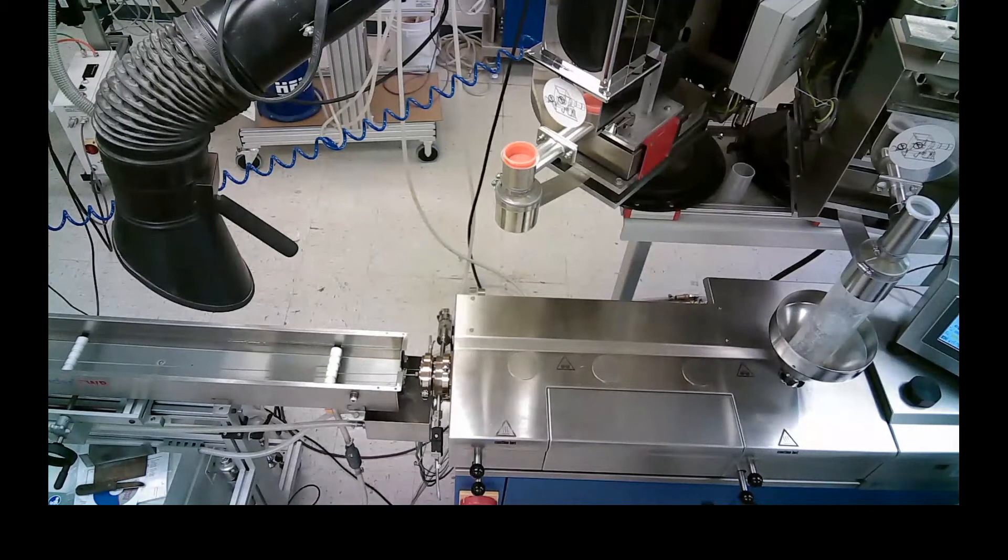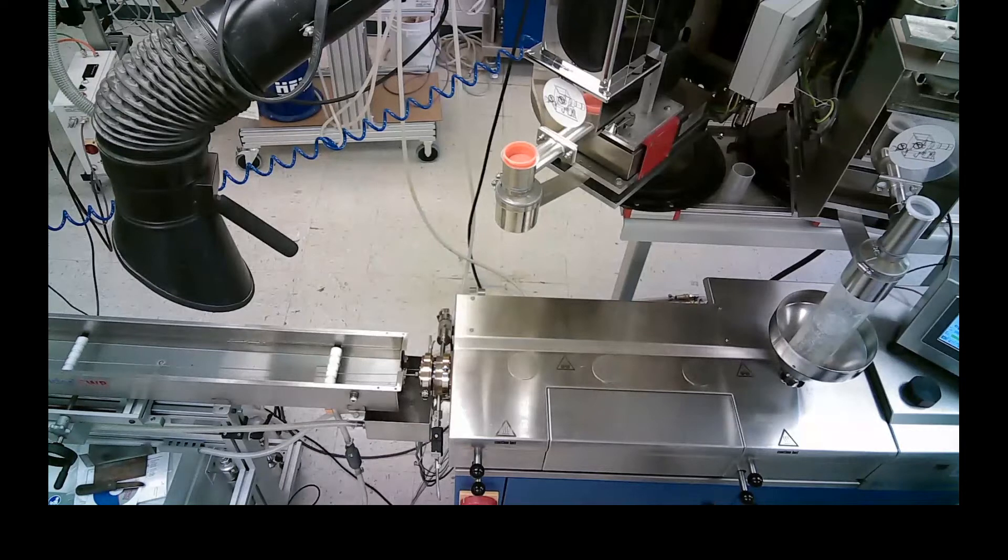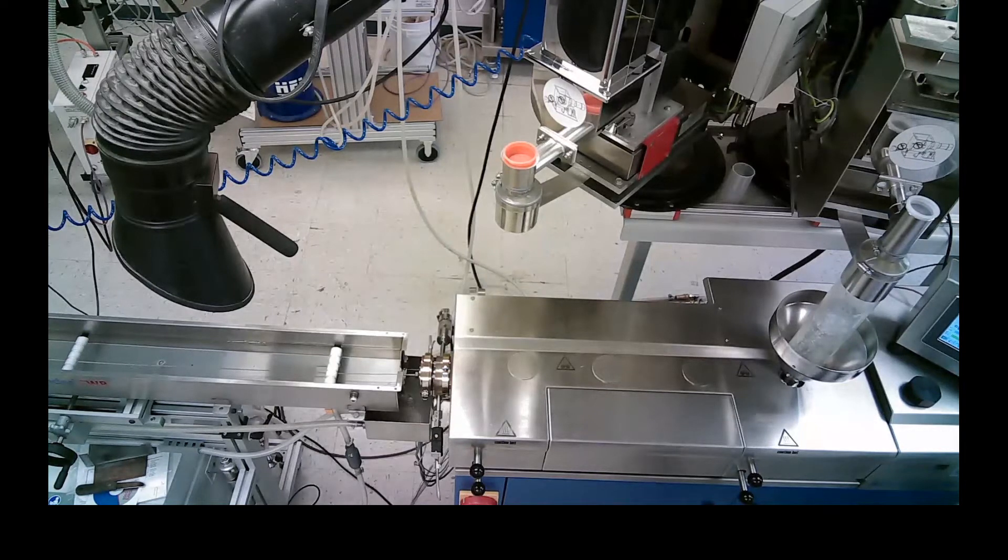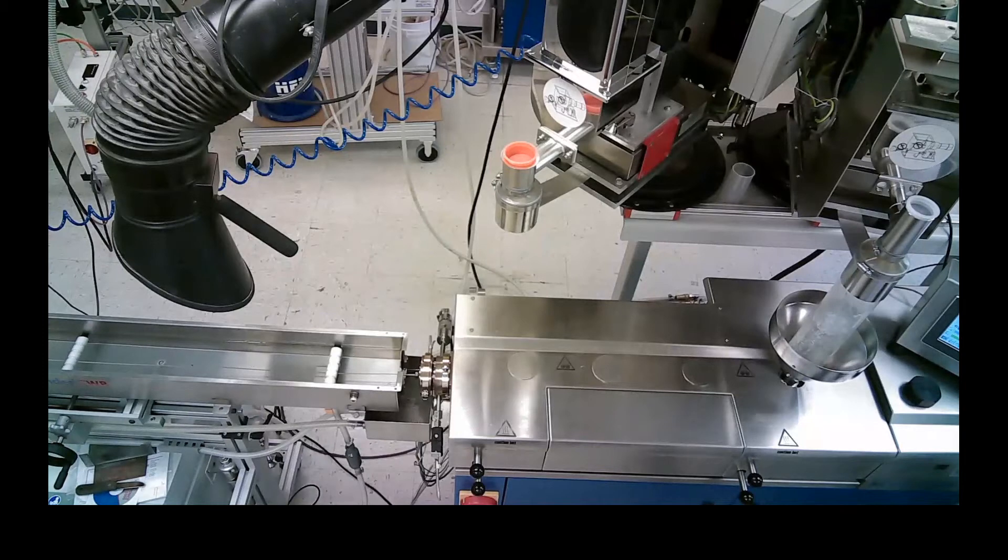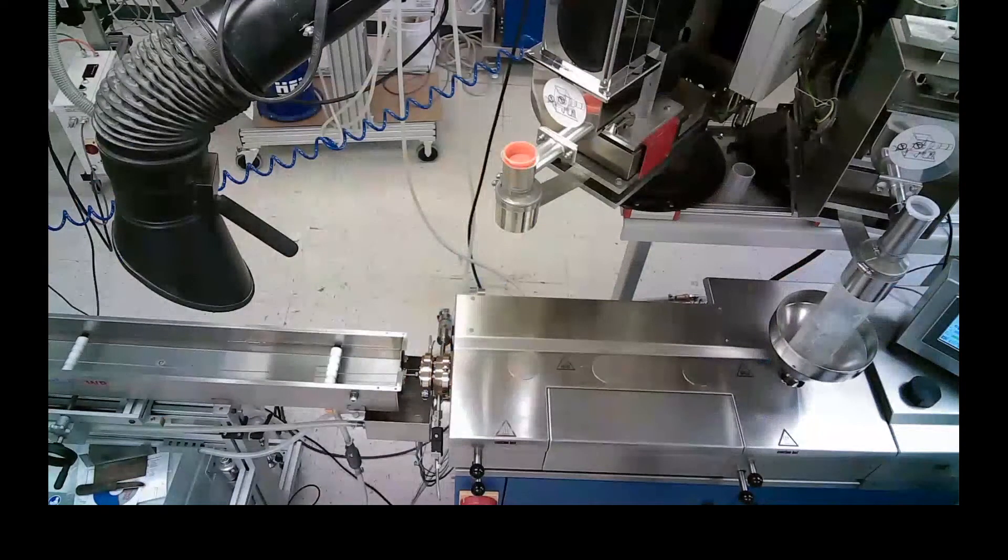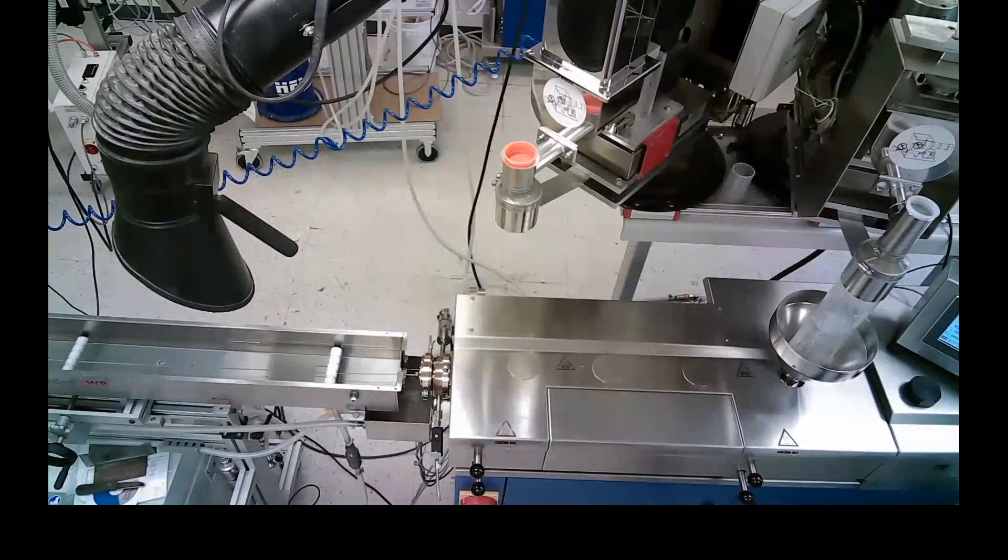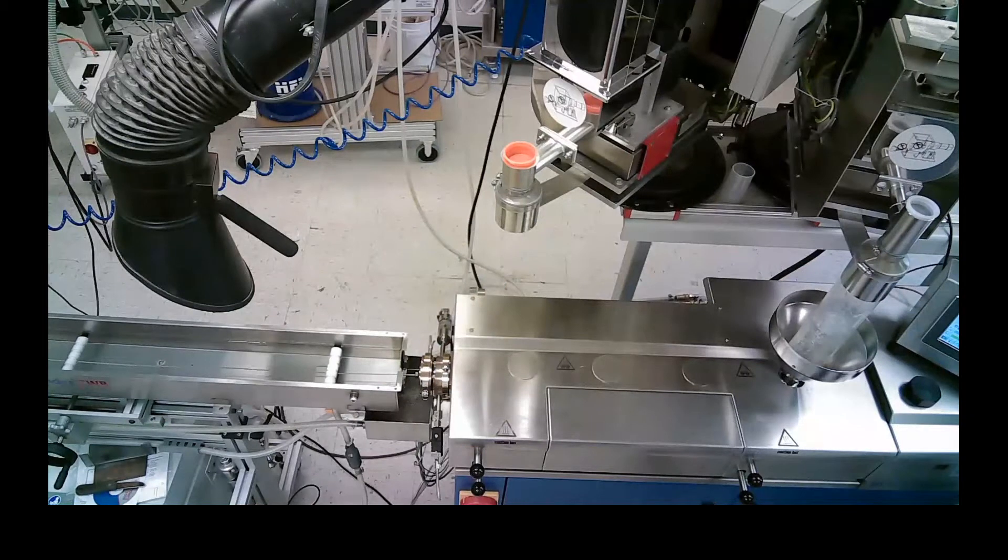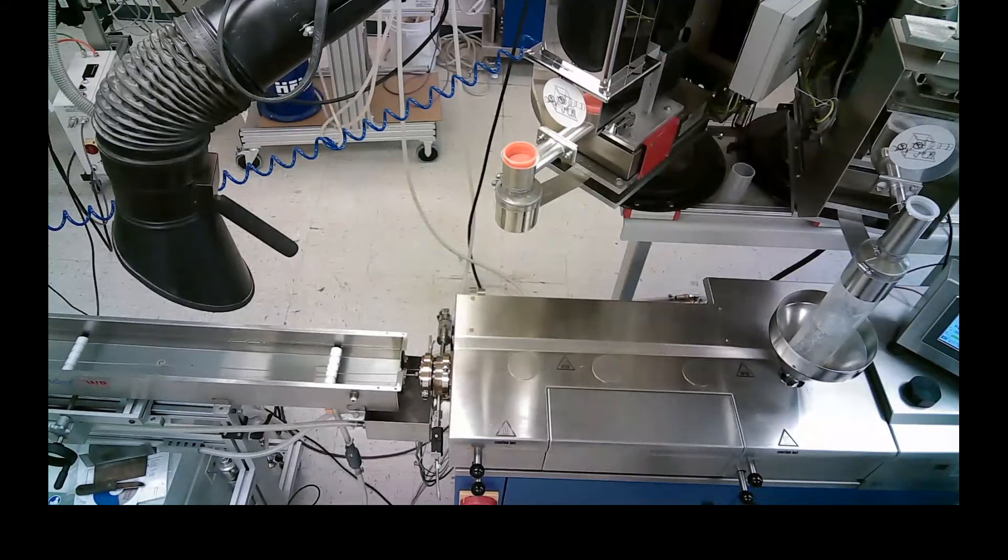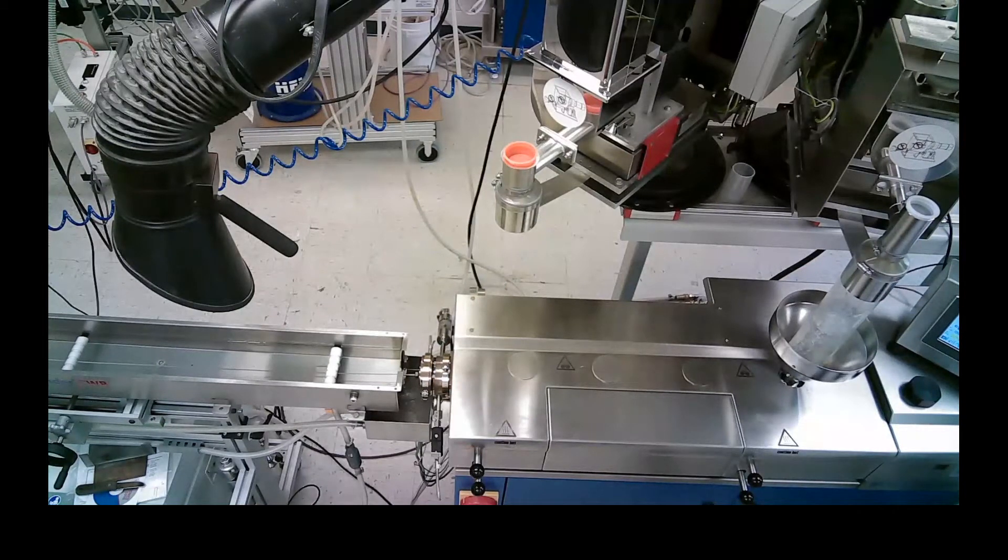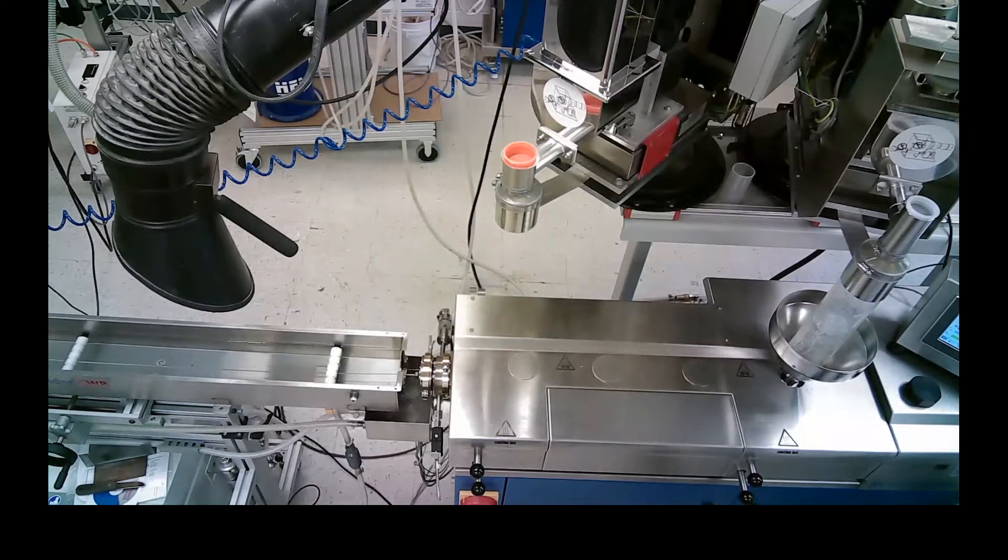With multiple top and side feeding ports you are flexible in the choice of feeding position, venting and liquid dosing. In total we have four top ports and two side ports. So if you need a high load of filler in powder form with side stuffers you can do two in a row.